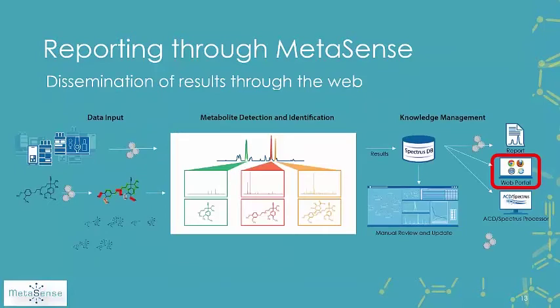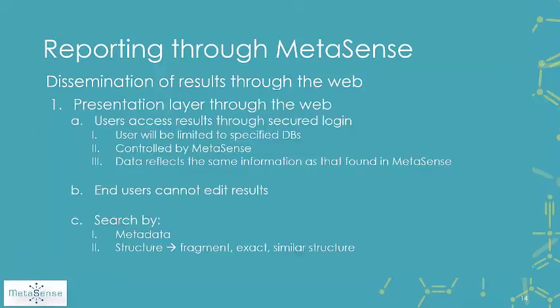The third way to really share the results is through our new web technology called Spectrus Portal. It's really for the dissemination of the results through the web. It's a presentation layer that we've developed, and again, it has some added benefit.